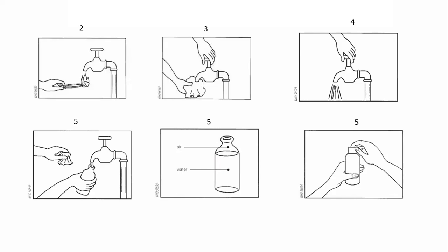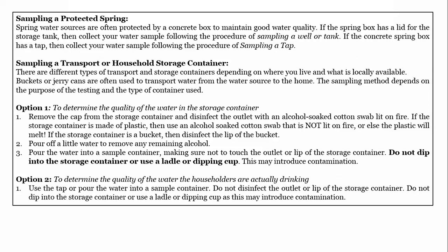And if you're going to do this for the water, you need to test for the quality based on what the community is actually drinking. You don't need to waste much time. You just need to open up, collect your samples, and see the same procedures here.